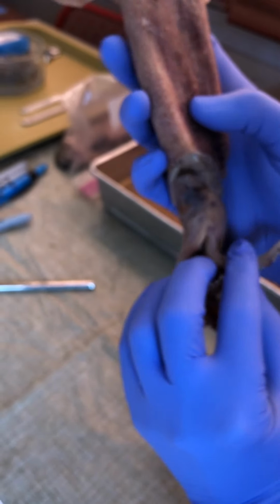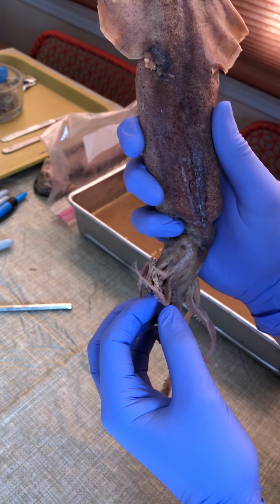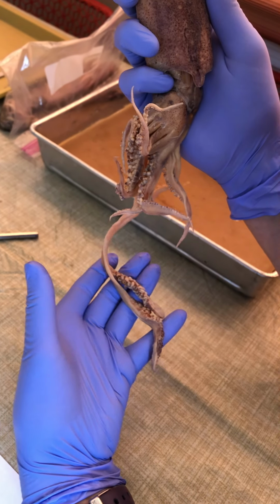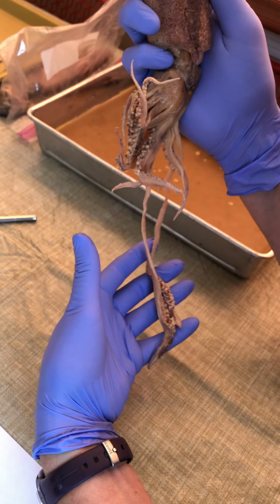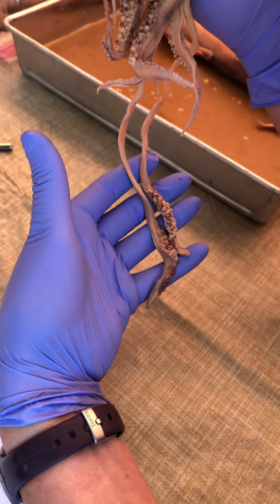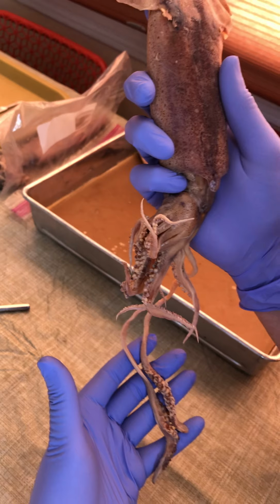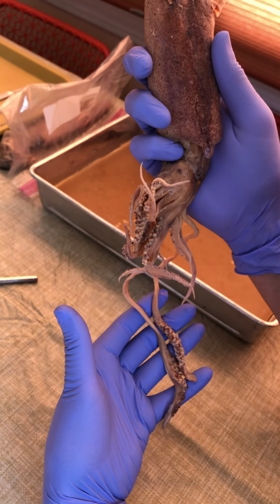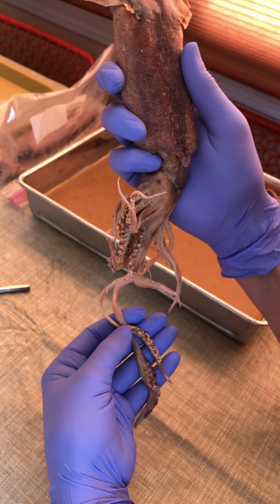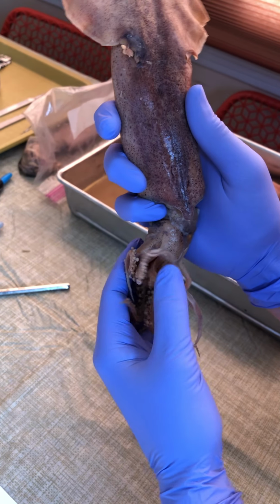We can count them. Okay, let's get everything lined up again. Here we go. So we can count 8 arms, 4 on each side, and then 2 of these longer tentacles. And these tentacles are raptorial. What that actually means is that they can be ejected and grab stuff really quickly. Like, for example, a chameleon's tongue. Exactly the same kind of idea, right? Raptorial, and it's based largely on a hydrostatic skeleton, which means that it's muscular.